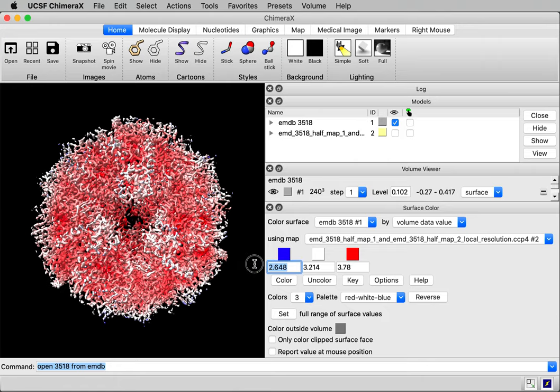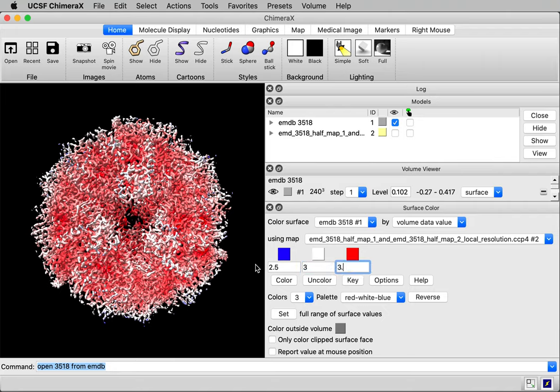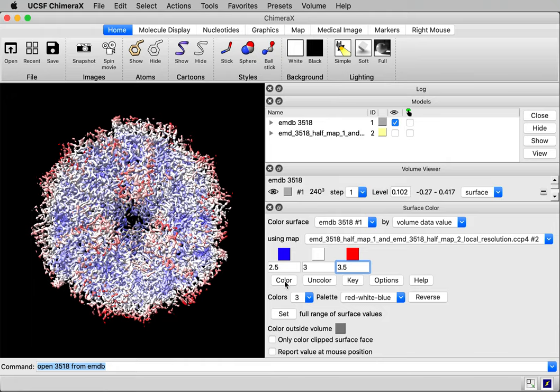And I'm going to change the values. It used the full range of resolution values shown on the map here. I'm going to instead make it 2.5 angstroms for blue, 3 angstroms for white, 3.5 for red, and press the color button.